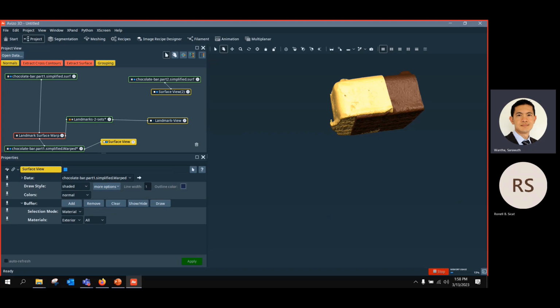For example, you copy 2 images, or at least make it 3 copies, and then you stack them on top of each other, so they understand it as a 3D volume. But we haven't tried it. What about top of each other? What about side by side? Maybe another tool which you can... Oh yeah, we have it. Yes. So I'll show you quickly.